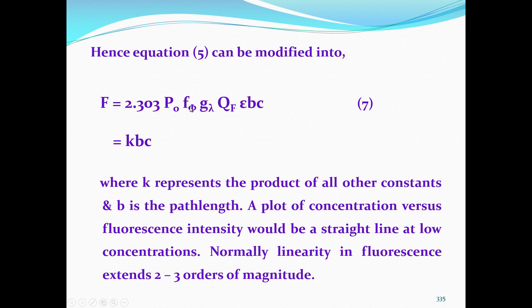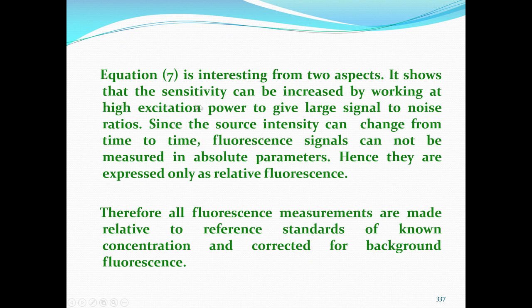So, more high input power, more is the fluorescence efficiency. So, that is one aspect, and the second aspect is it gives a large signal to noise ratio.